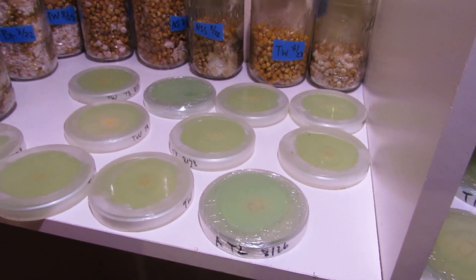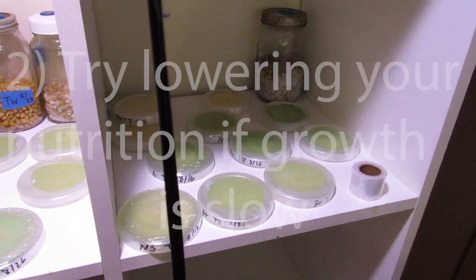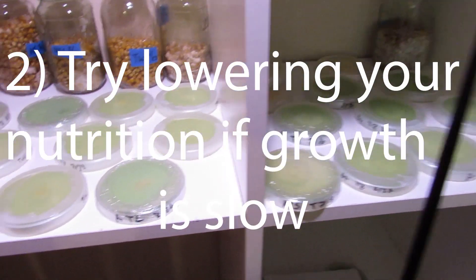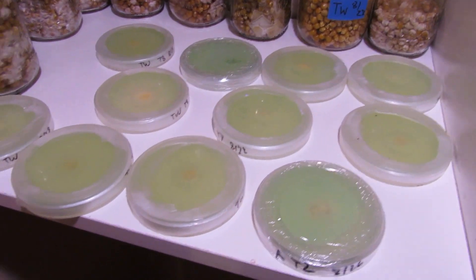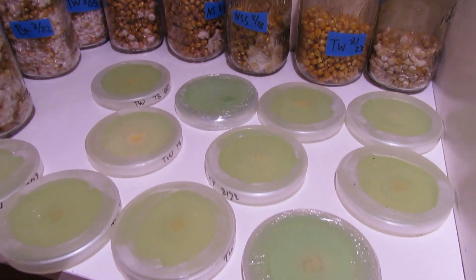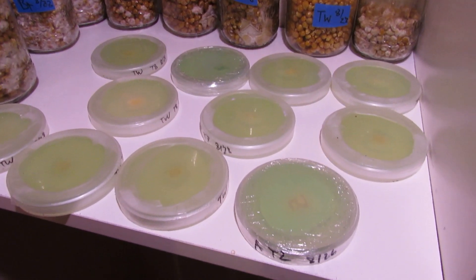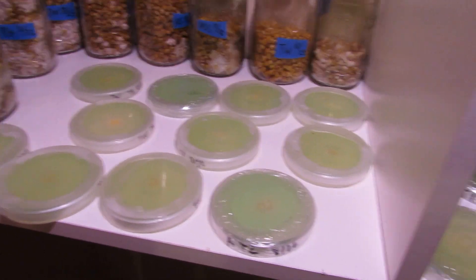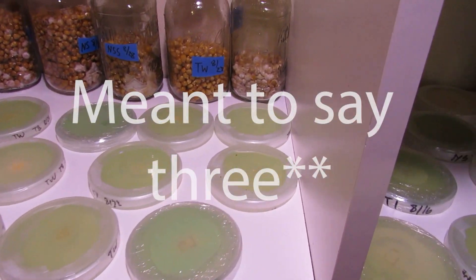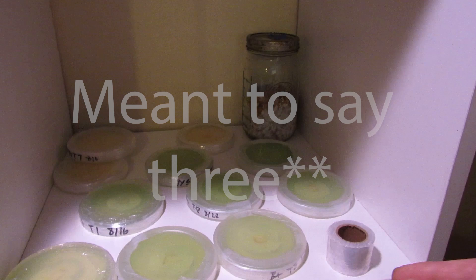Number two: if your growth is coming in kind of slow, try lowering your nutrition. If you're using light malt extract, try using a gram and a half to two grams less and see if that promotes faster growth or rhizomorphic growth. I found it to be quite useful.